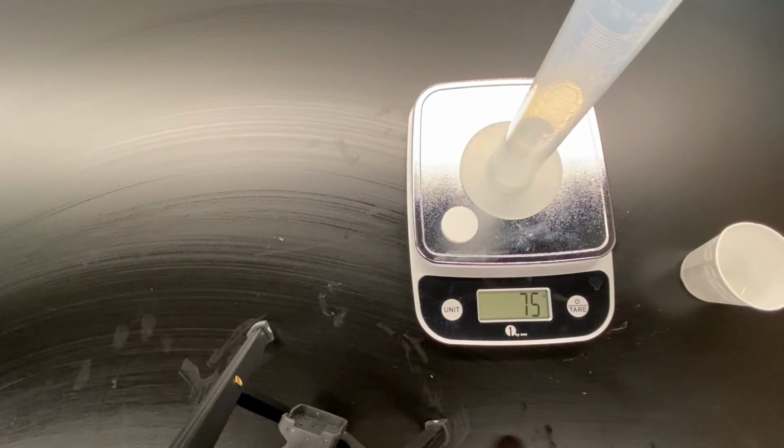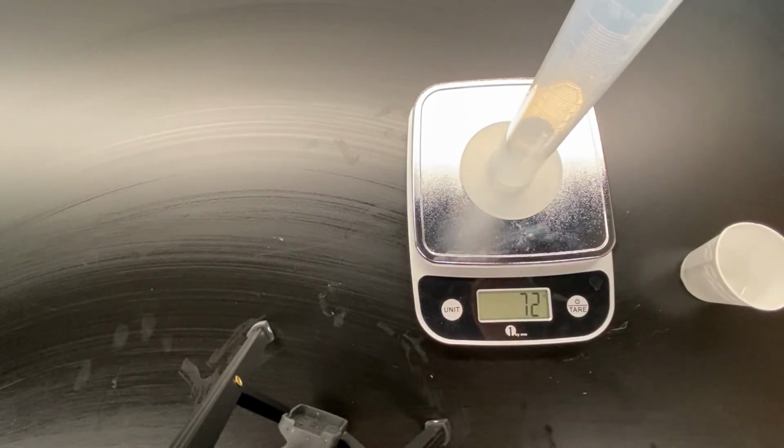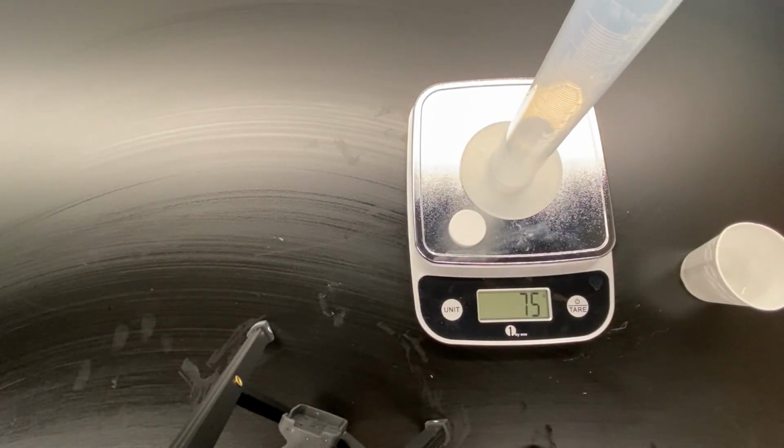Then you're going to make a prediction. When we drop the tablet in the water and it fizzes, do you think the weight will go up, down, or stay the same after it's all done fizzing? So go ahead and make your prediction in the prediction box at the top. After the experiment, we'll weigh it again and see if your prediction was correct.